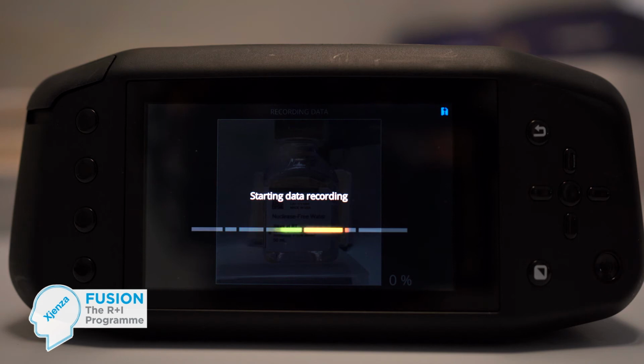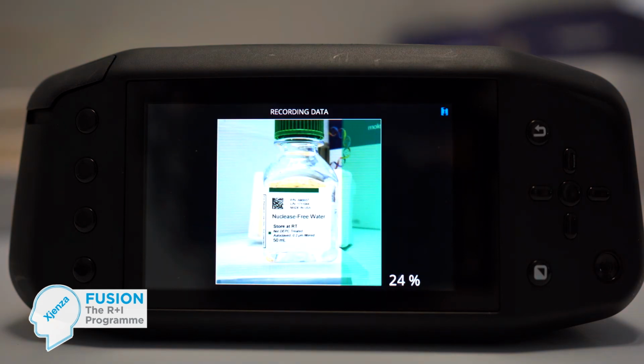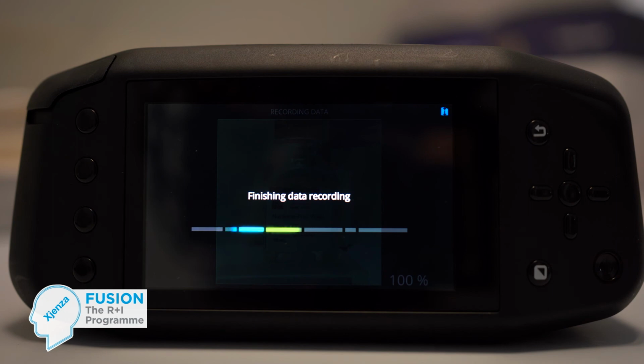However, it can be redeployed for different purposes, such as testing for these other contaminants that may be present in food samples. As part of the future of this product, of course, the hyperspectral camera has many different applications, such as testing not just contaminants which are microbial in their nature, but also metals or antibiotics or any other chemicals that might end up in the food supply chain.